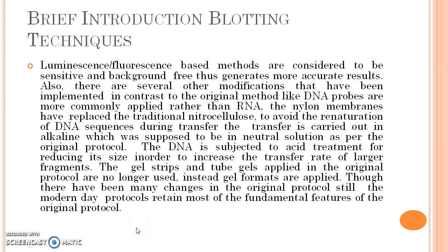Luminescence and fluorescence-based methods are considered to be sensitive and background-free, thus generating more accurate results. Also, there are several other modifications that have been implemented in contrast to the original method, like DNA probes being more commonly applied rather than RNA. Nylon membranes have replaced the traditional nitrocellulose to avoid the renaturation of DNA sequences during transfer. The transfer is carried out in alkaline solution, which was supposed to be a neutral solution as per the original protocol.